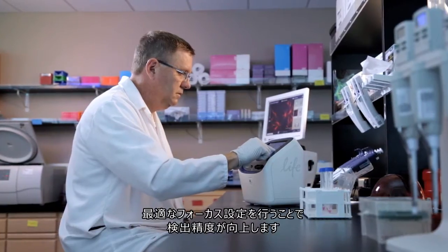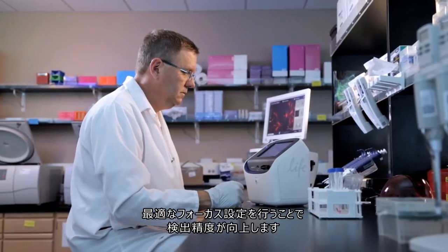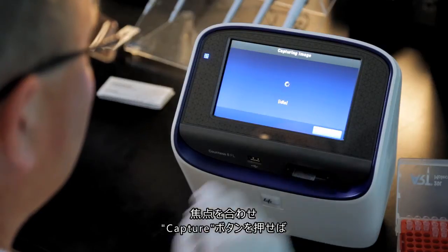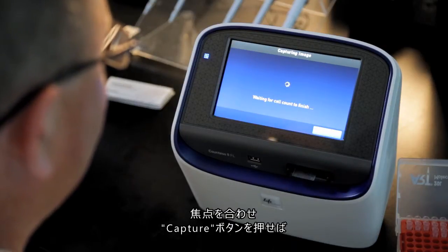To increase precision in the cell count, the Countess2 FL counter automatically scans through the focal range of the sample to find the optimal focal plane. After the cells have focused, press capture to begin your cell count.